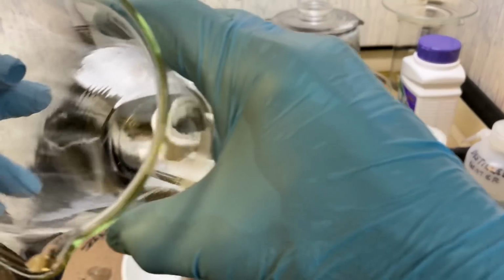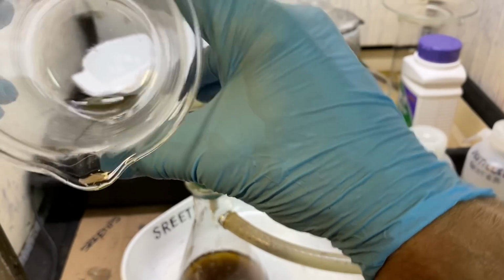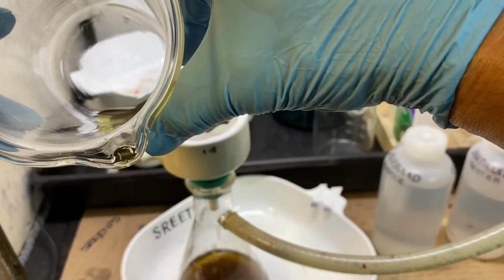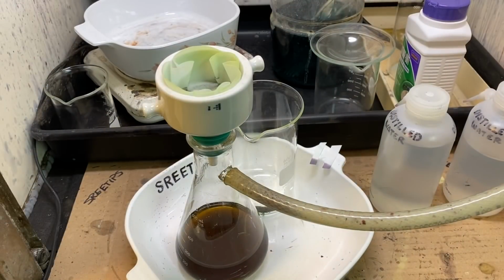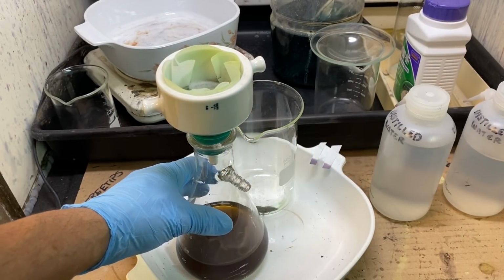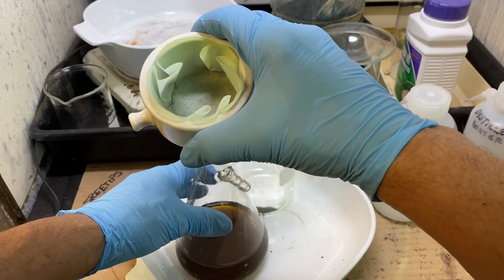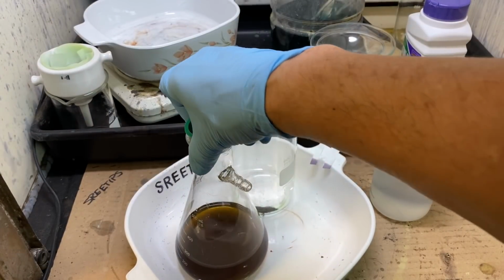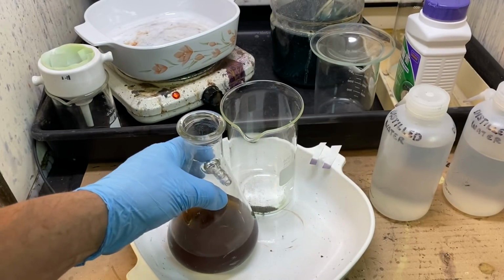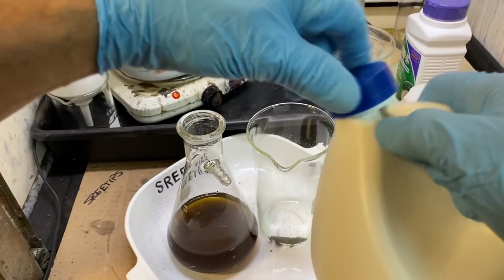There's our gold powder down in the bottom of the beaker. Not much, looks like less than 1 gram. Okay, we're almost done here. The filter's got like nothing in it. It'll just go in my paper storage. And what I'm going to do now is rinse the gold off in our beaker. Boy, that's a pitiful amount right there.